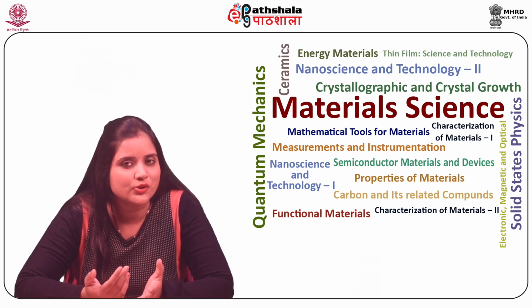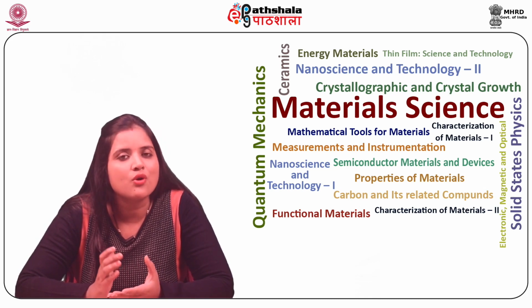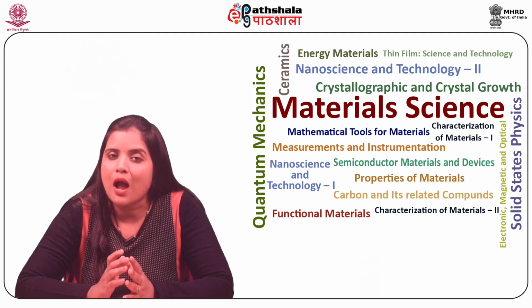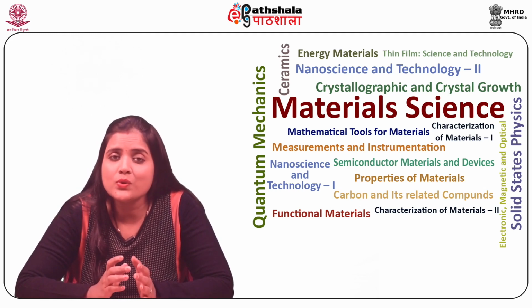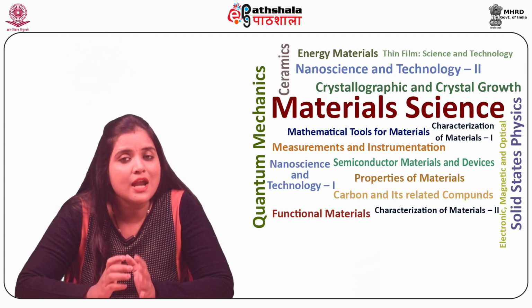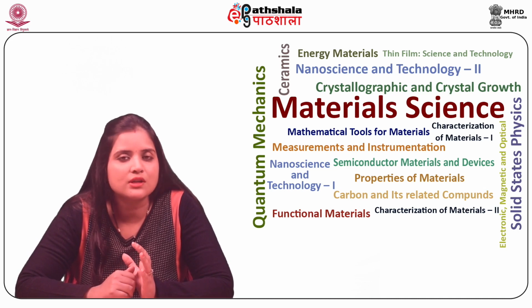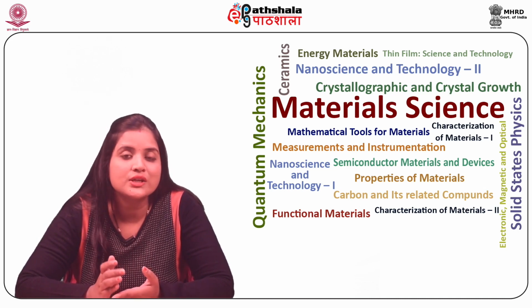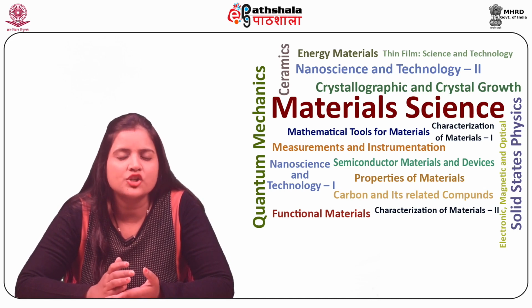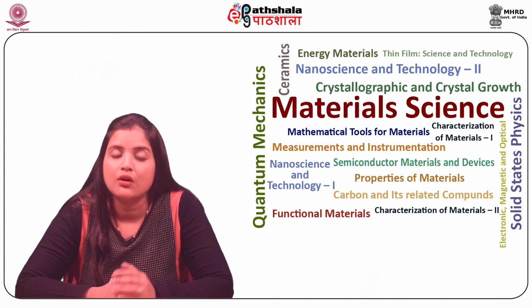Oil immersion microscopy relies on using one or more oils on an oil-appropriate lens. These lenses can be used for studying inanimate or dead specimens. Most commonly studied samples are bacteria, muscle tissues with pronounced striations, as well as samples having small definable structures.